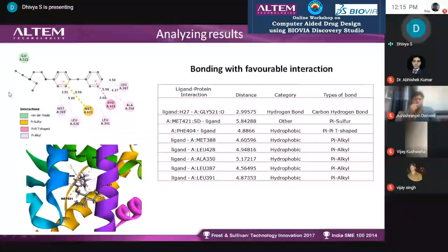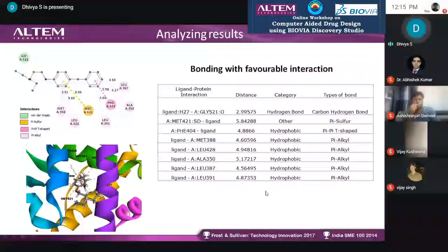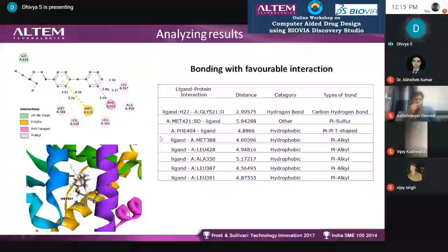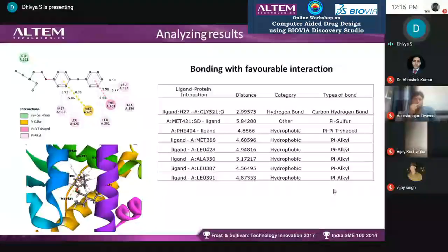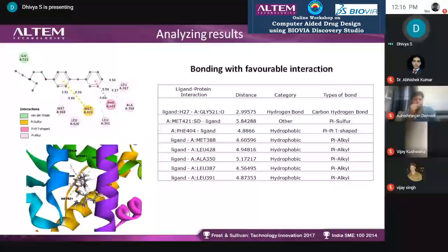The output includes distance information for interactions: atomic-level interaction, what is the distance, what is the category of the particular interaction, and what bond types are happening. You can tabulate this easily, and this is how it will be presented in the 3D view.